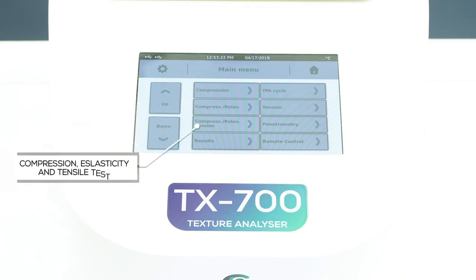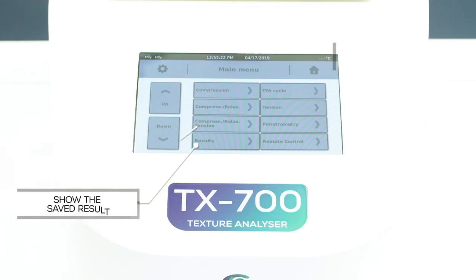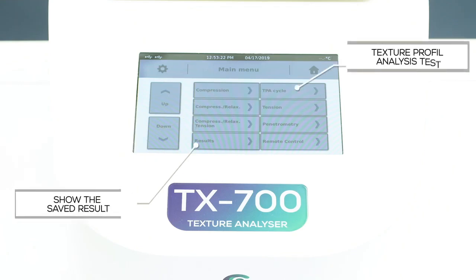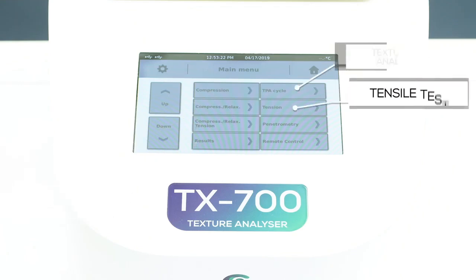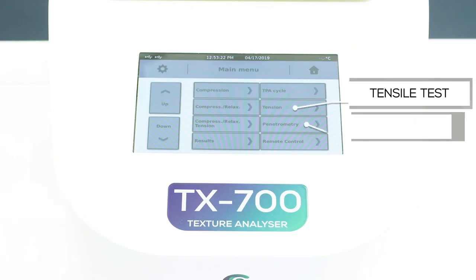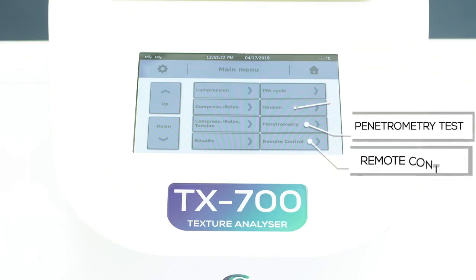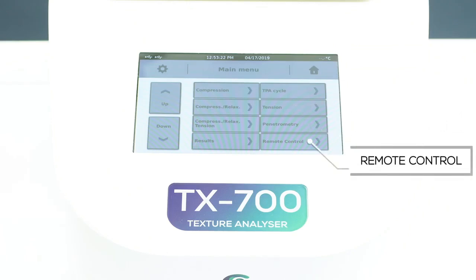Compression, Elasticity and Tensile Test, Show the saved result, Texture Profile Analysis Test, Tensile Test, Penetrometry Test. To activate the remote control.